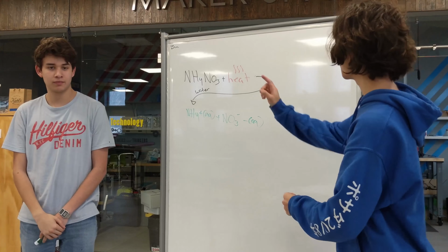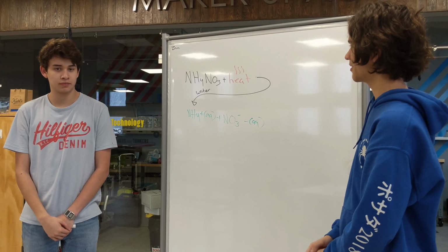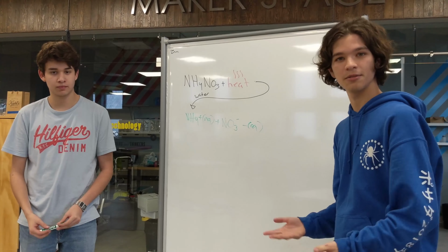Yes, I can see that heat is absorbed in this reaction, making the flask feel cold.